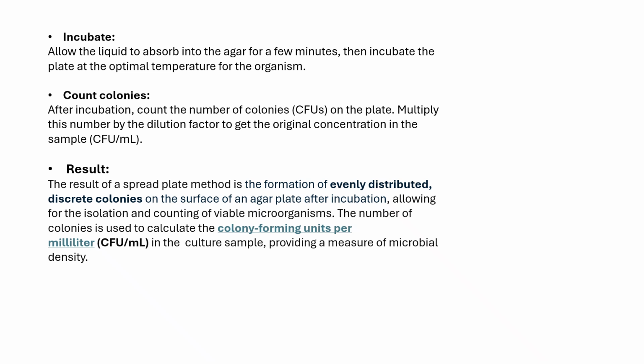The result would be the formation of evenly distributed, discrete colonies on the surface of an agar plate after incubation, allowing for the isolation and counting of viable microorganisms. The number of colonies is used to calculate the colony forming units per milliliter in the original liquid sample, providing a measure of microbial density.